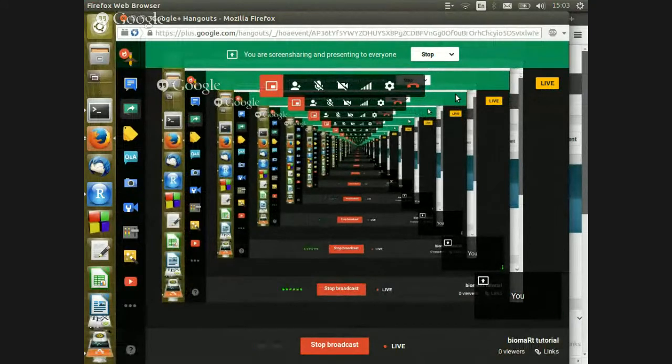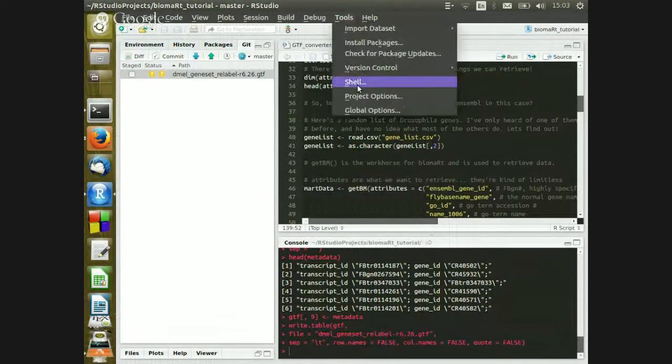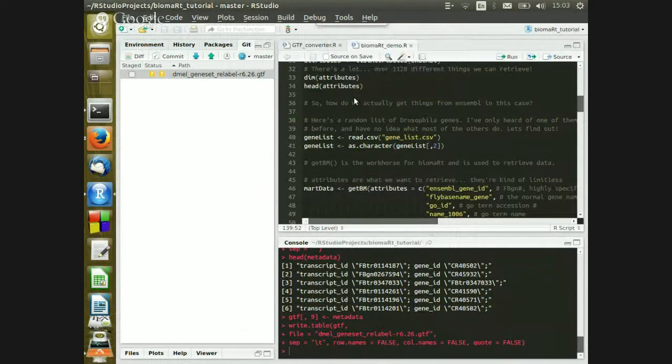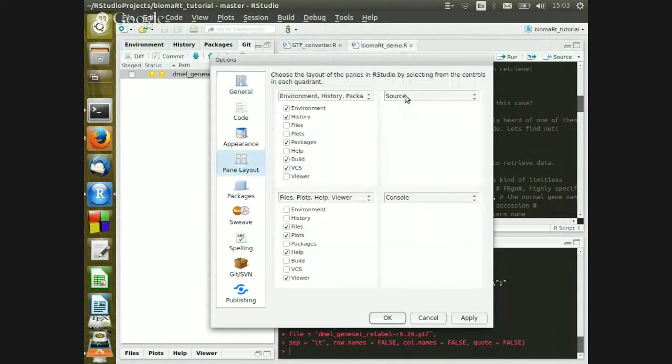So I thought we could start off with some really trippy things from my desktop. We're good now, but Bill? Excellent. Okay, cool. So just let me know if things disappear off the bottom. I think I'm actually going to swap these windows just to make it a little bit easier to see. Let's let these load. In layout, we'll switch source and console. Excellent.